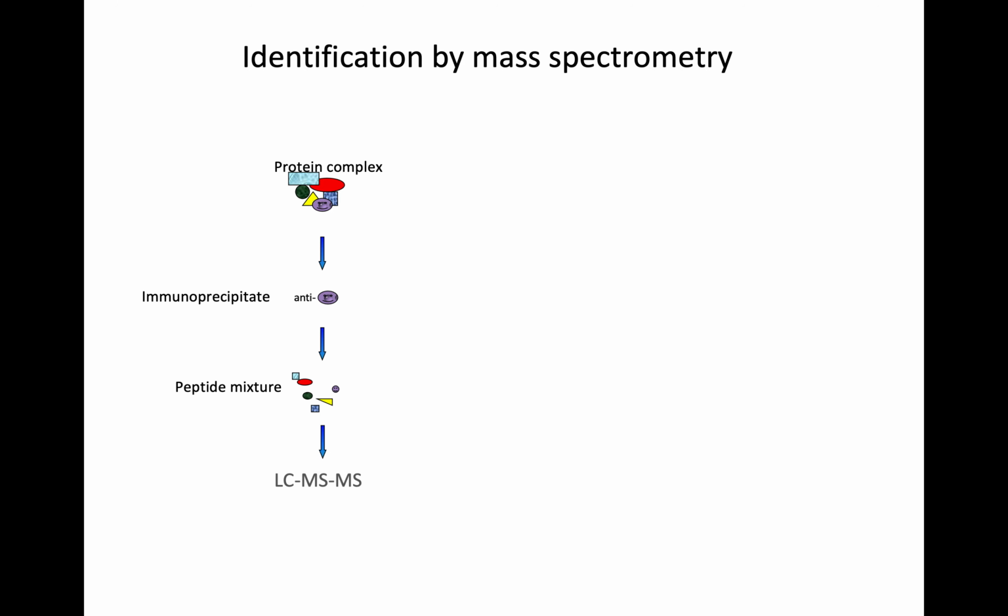You can immunoprecipitate using an antibody or a yeast tag and so forth, but a lot of times people don't go through this. We just use a protease enzyme to digest the protein to get a mix of peptides, and then we subject it to LC-MS. This is basically the shotgun identification. You don't think shotgun only refers to the genome, right? In protein we also have shotgun identification.